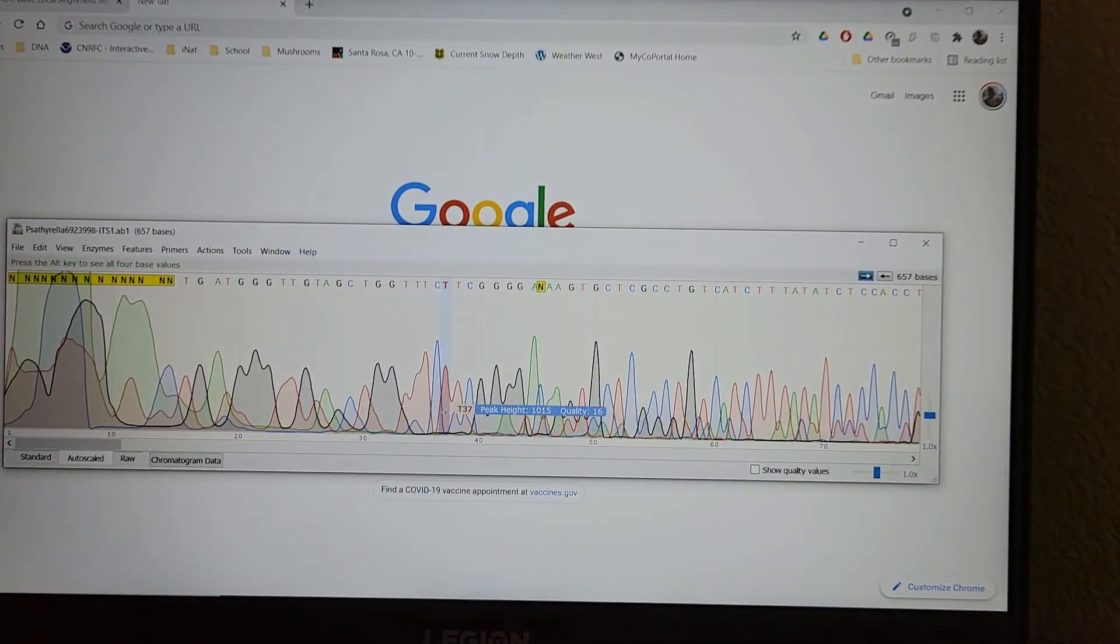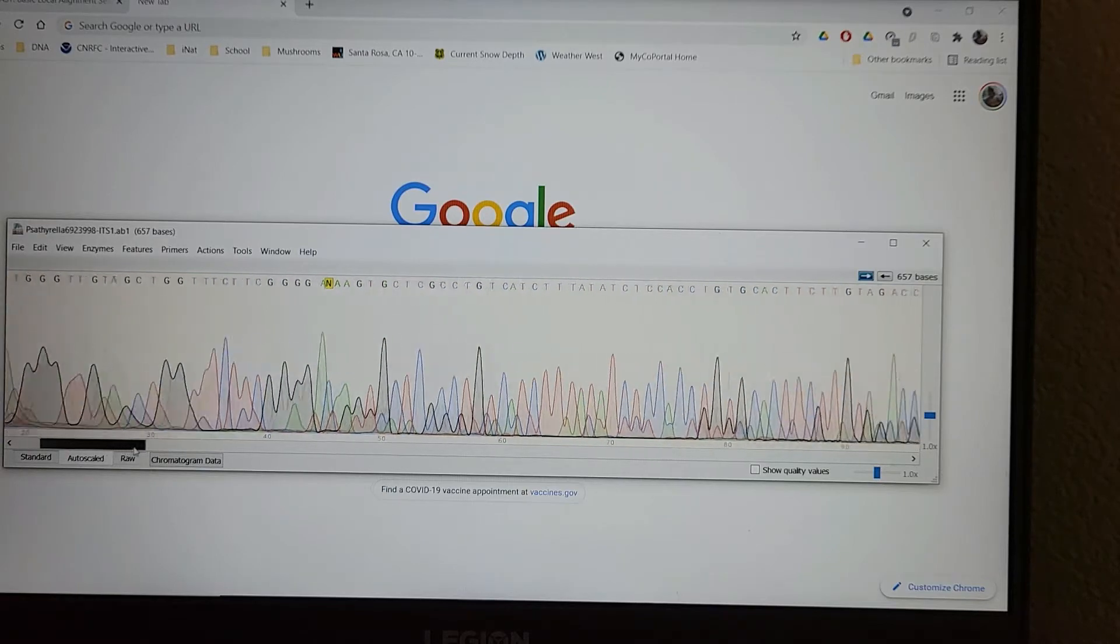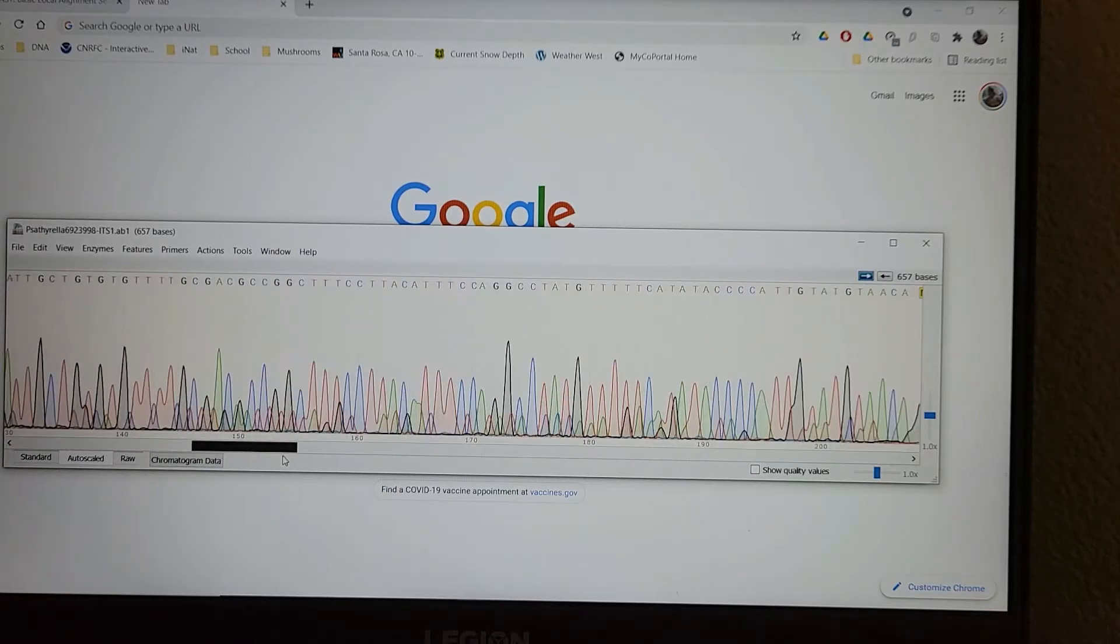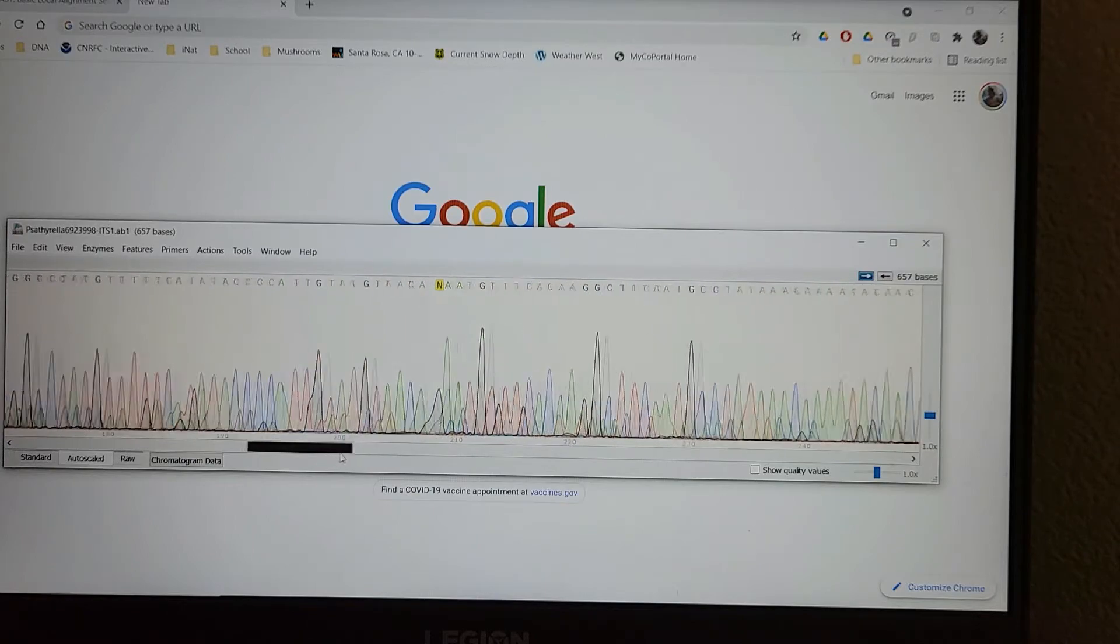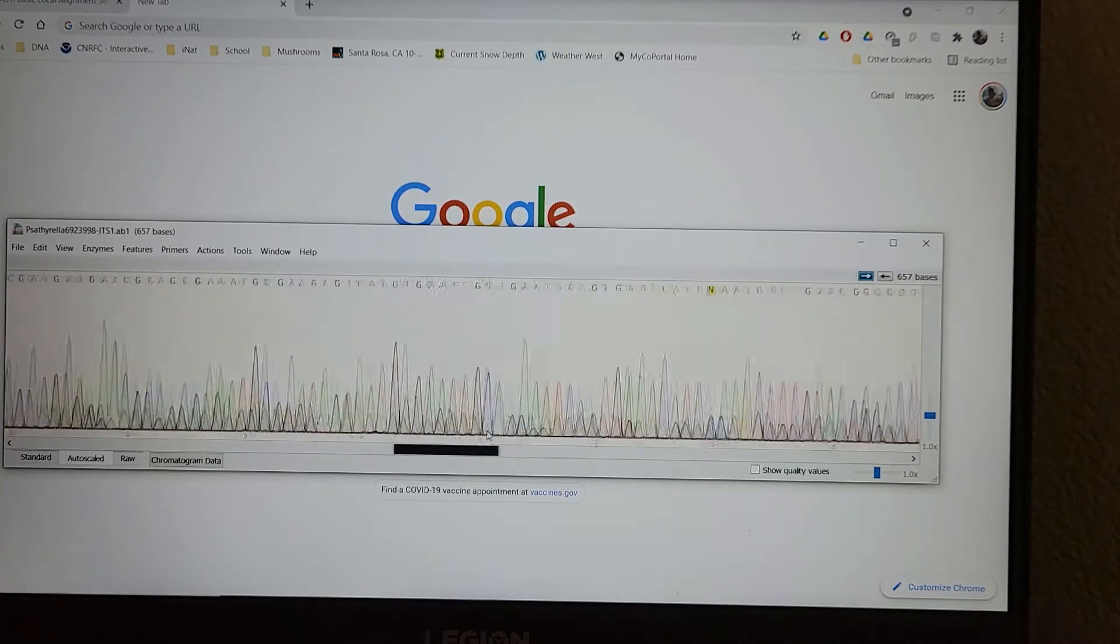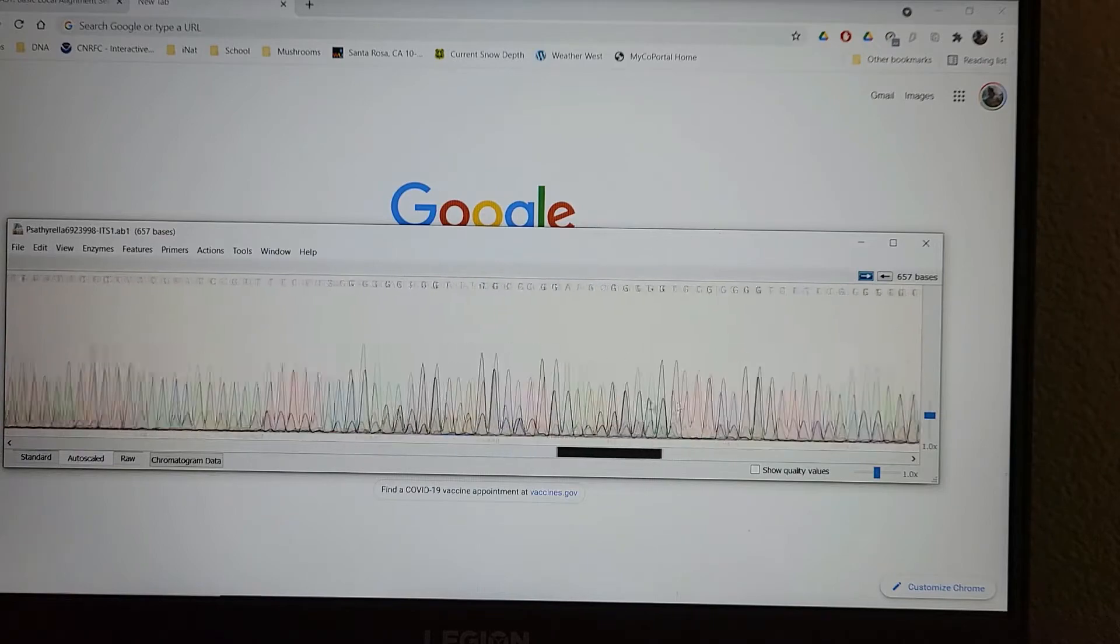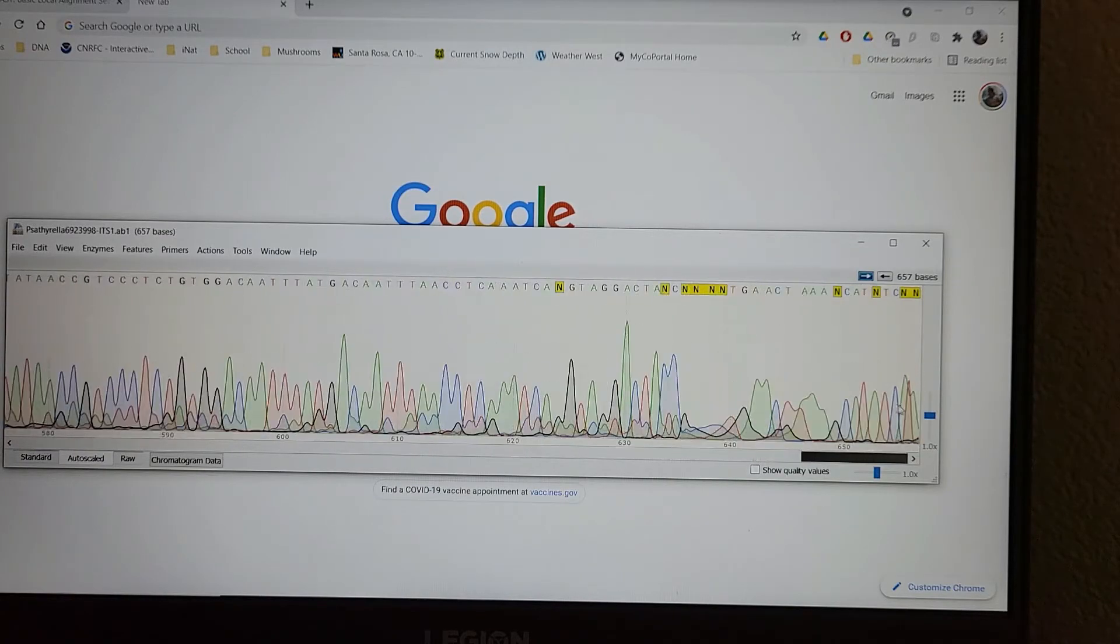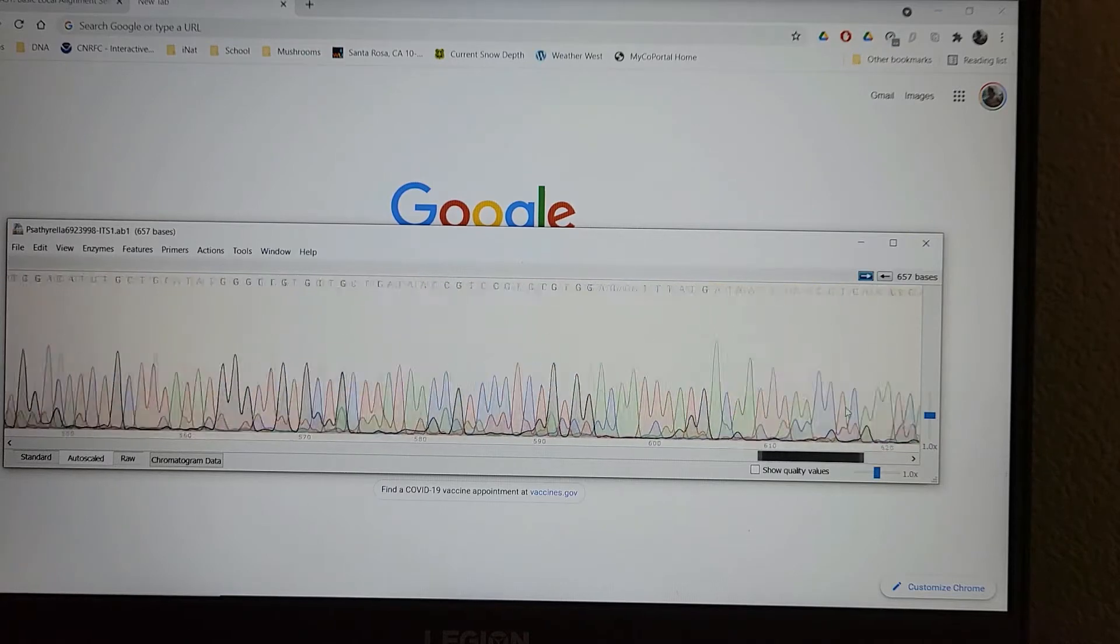And then you'll see it's very jumbled. We'll start scrolling through, you see this kind of mess. It keeps calling, missed calling the base pairs, you get another N.